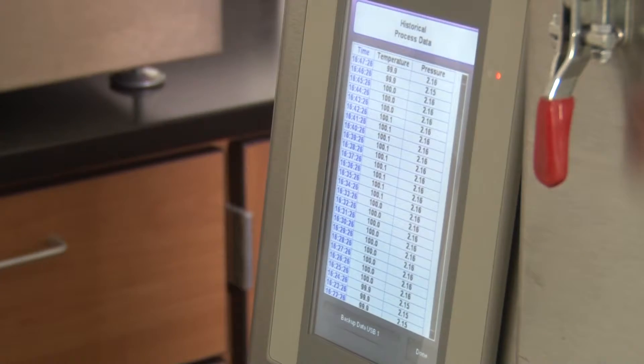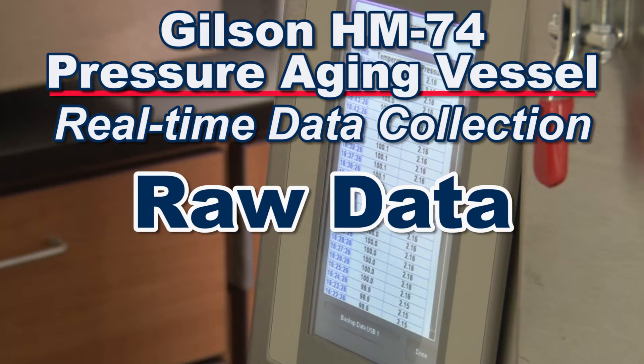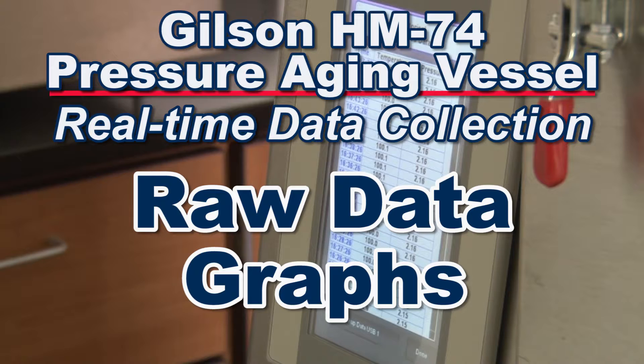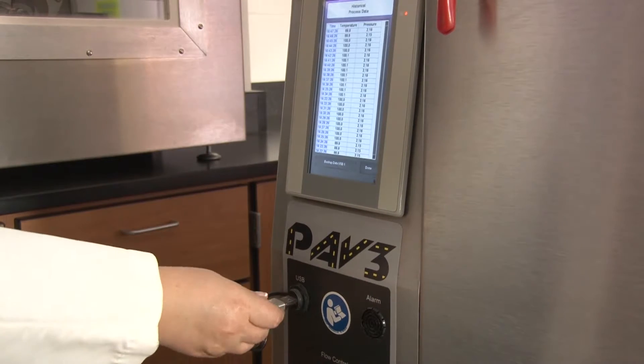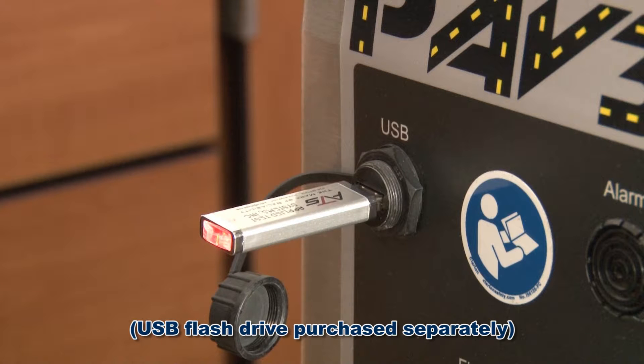Data is collected throughout the test and is displayed in real time on the touch screen in raw data or graphs. And after the aging process has completed, the front USB port allows users to easily download data.